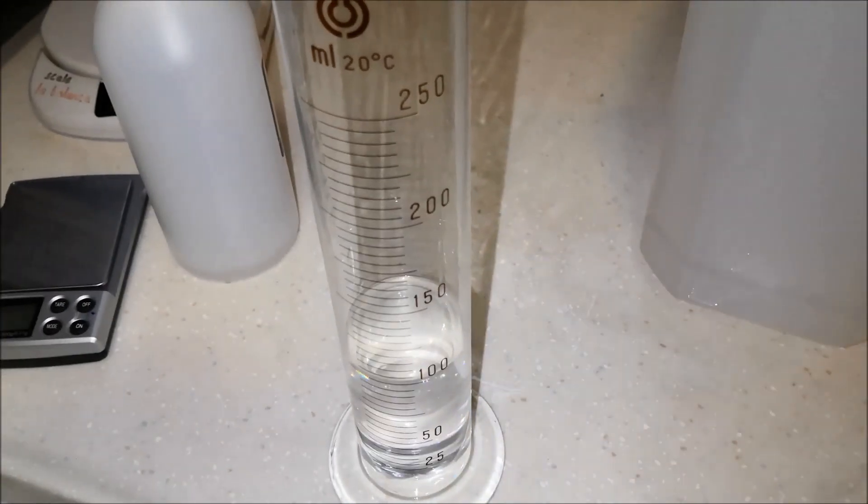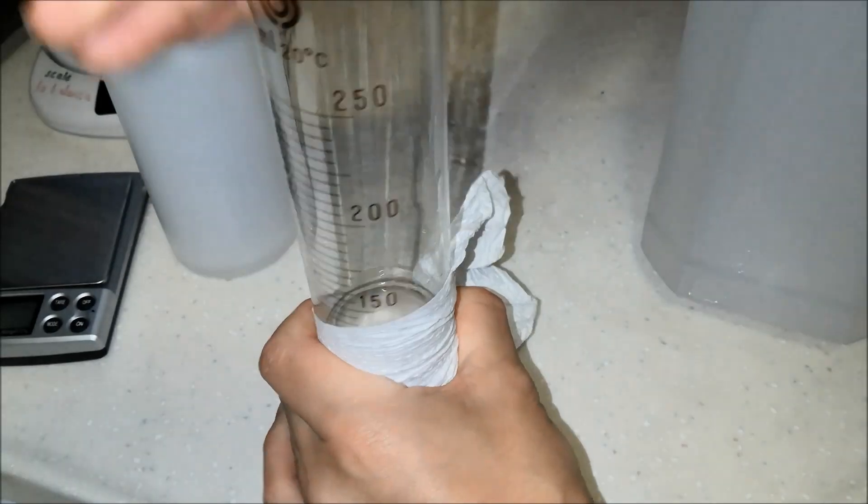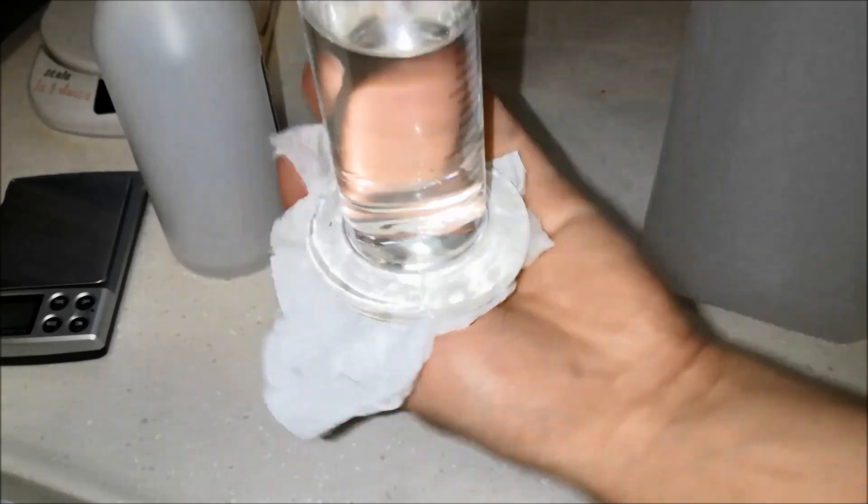Okay. So we've got our 100 mls of isopropyl alcohol. I spilled a little bit on the outside of this. So I'm going to wipe off the excess that I spilled on the outside. Because I don't want that to affect my measurements.